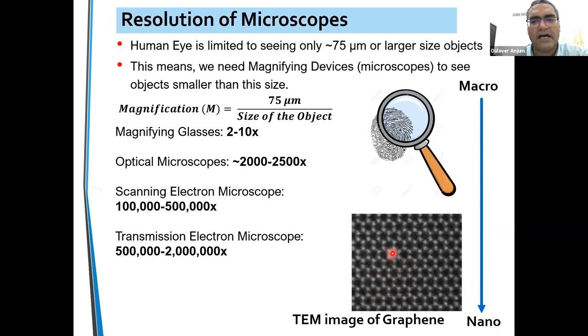You can see the graphene atoms are sitting in the graphene lattice in the honeycomb, hexagonal way. So we clearly see atoms. Each white dot in this image is basically one carbon atom in the graphene. And this is unparalleled, a very, very powerful technique. It allows us to see not only atoms, but, let's say, if there is a missing atom, we can clearly see that there will be a black point at that atom location, and things like that. If there is a bigger atom, such as silicon, or you have changed it for some reason, that will be brighter than the carbon atoms. So this is already telling us a lot of information just from a single image.